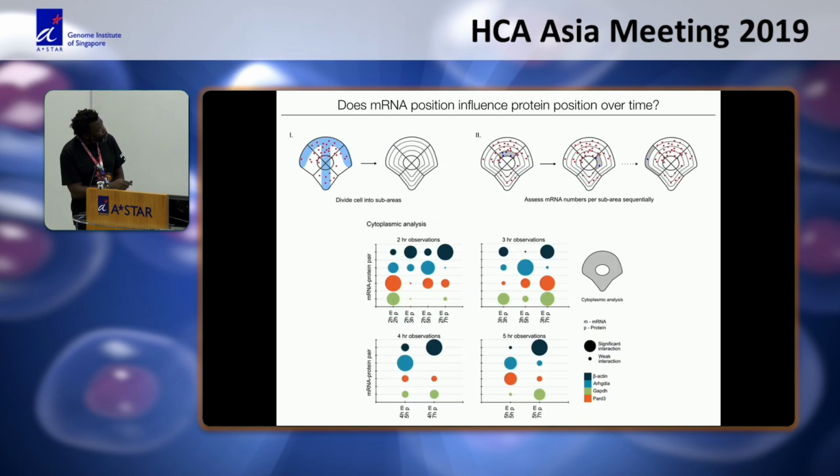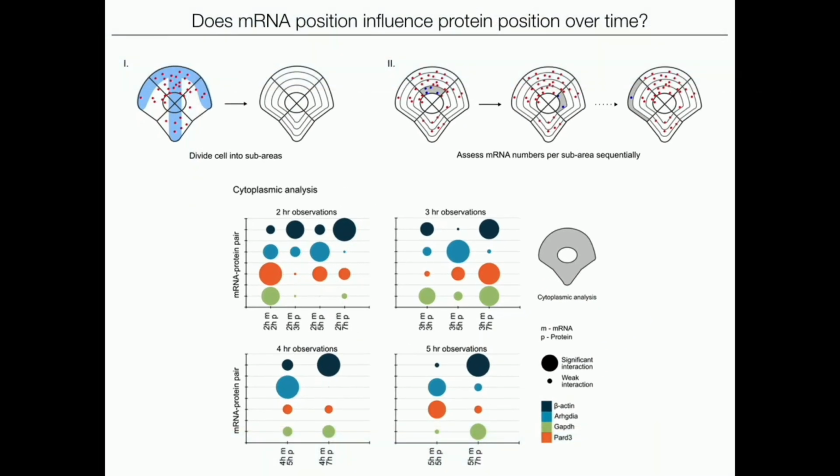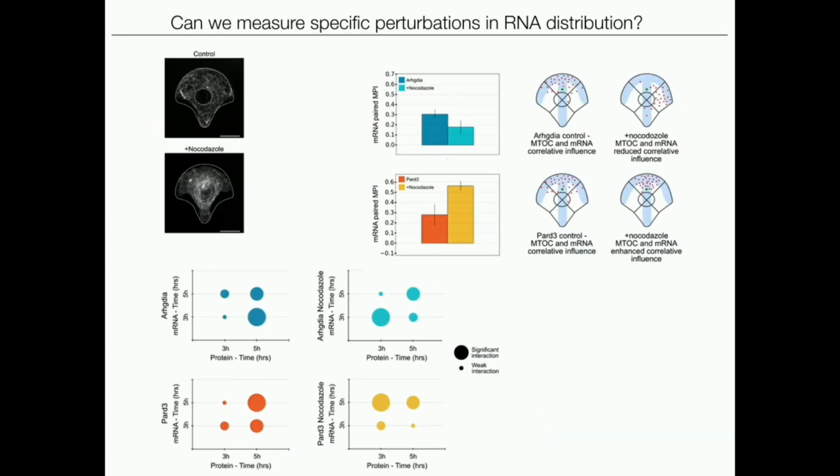immunofluorescence. So we could use this type of analysis together with spatial analysis at different positions of the cell to assess specific areas where we have enrichment at different time points, and also superimpose this on where we see the MTOC being deterministic of where those enrichments happen. So sometimes those enrichments happen in the same compartment as the MTOC or same directionality as the MTOC, and other times the MTOC is in a completely different compartment from where the enrichment of the RNA is occurring.